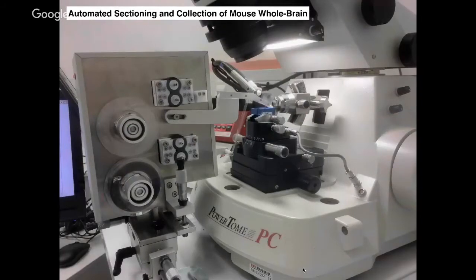So now that we have a brain, we want to be able to cut it up and image it using high throughput EM. There are different ways we can go. I mentioned 3 previously. FIB-SEM is ruled out because of the limited depth that you can actually mill away before problems occur, which is limited to, I think, 100 microns or less. And so that left the serial block face approach and the serial sectioning approach.